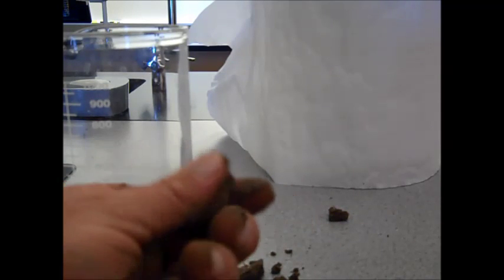This soil has a high percentage of clay. If it doesn't do this, it's got a high percentage of sand or silt. And so you're going through the process of feeling your soil to determine the components of sand, silt, and clay. There's a process that dead ends at each one and gives you the answer of what your soil is. This takes lots of technique and lots of practice, but I know enough to say, boy, this soil has a big percentage of clay in it. Okay? That's how easy the feel method is.